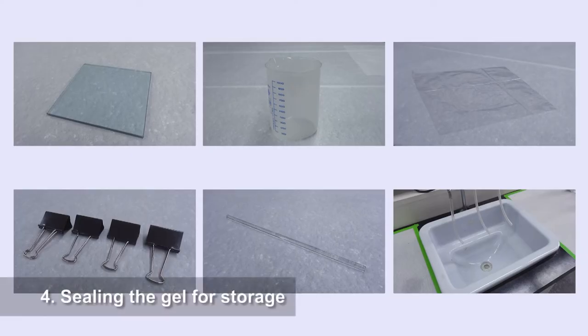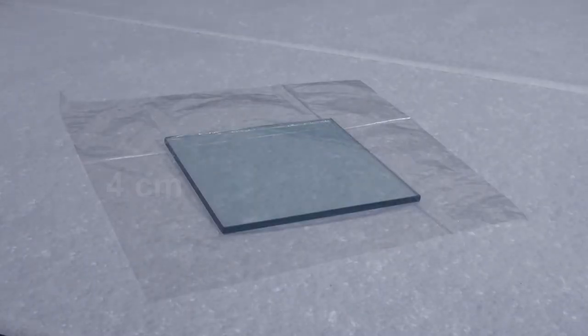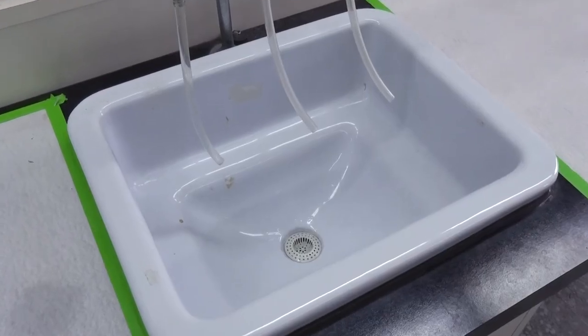Sealing the gel for storage. The equipment needed to seal a gel for long-term storage include a thick glass plate, a platform, two pieces of clear food wrap four centimeters wider than the glass plate on each side, at least four binder clips, a glass rod, and a sink with a tap.